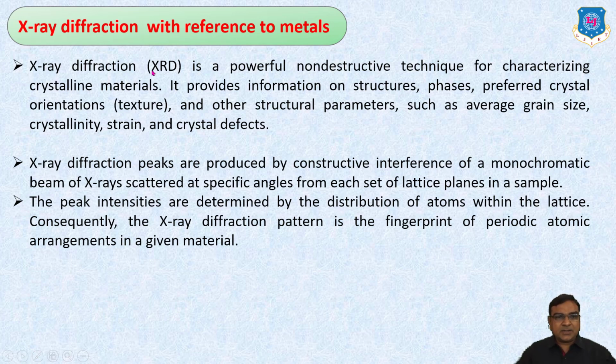X-ray diffraction, or XRD, is a powerful non-destructive technique for characterizing crystalline materials. It provides information on structures, phases, preferred crystal orientation, that is, texture, and other structural parameters such as average grain size, crystallinity, strain, and crystal defects.